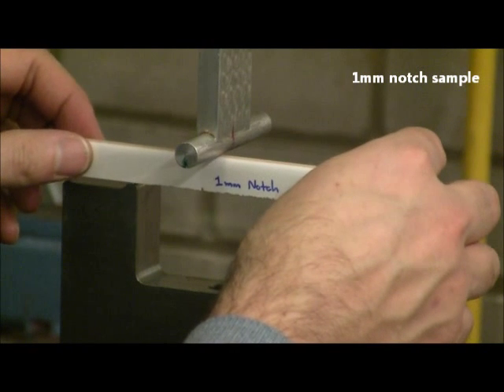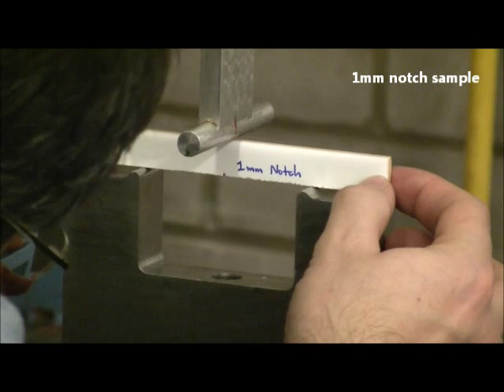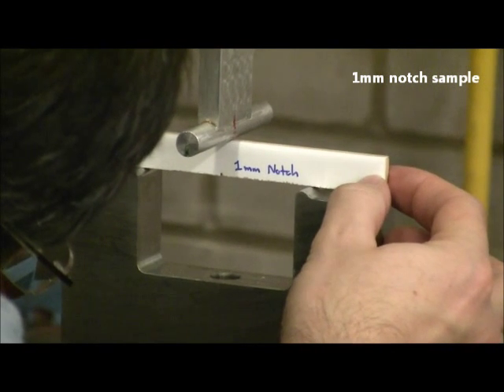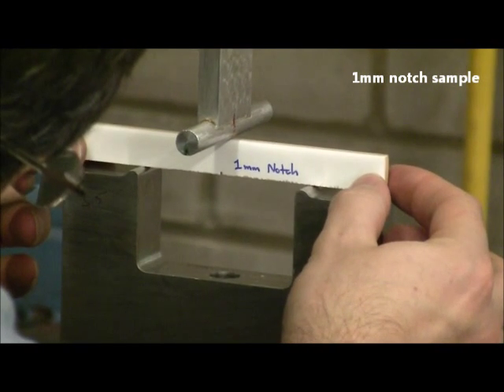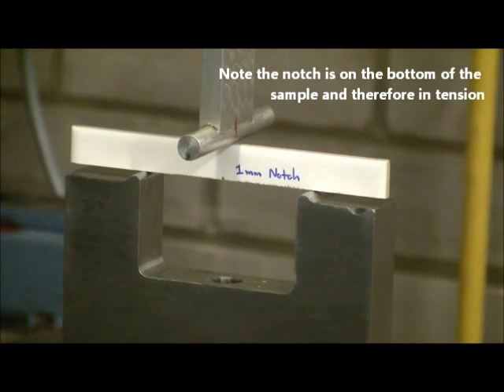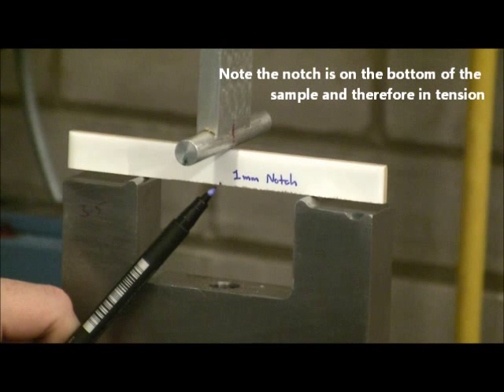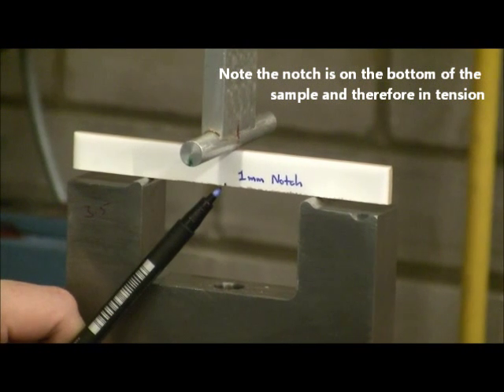This is the one-millimeter notch sample. You can just see the one-millimeter notch on the bottom surface. The notch is opposite where the load is being applied from the top. And because the notch is on the bottom surface, it is in tension in this particular scenario — three-point bending.